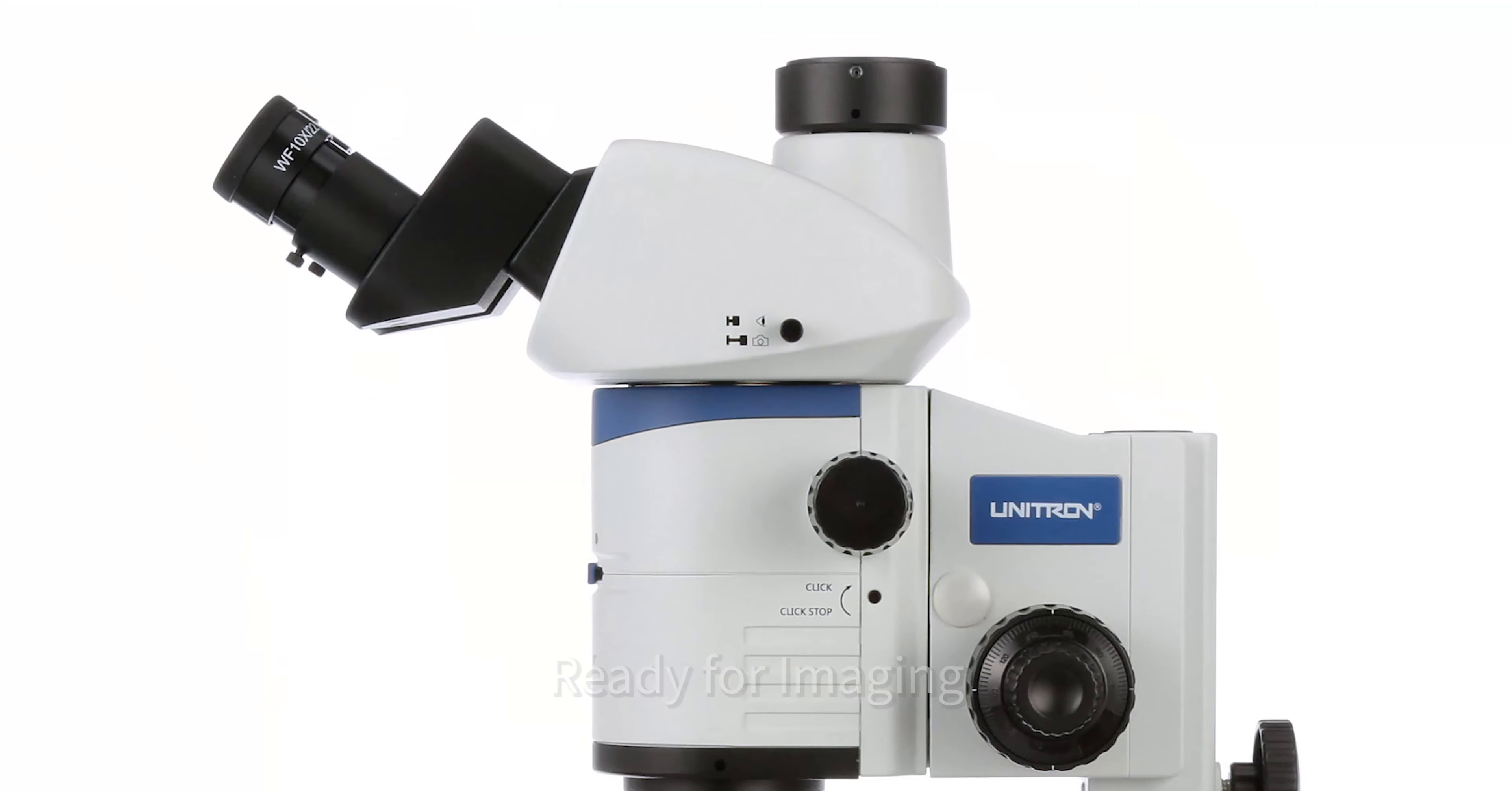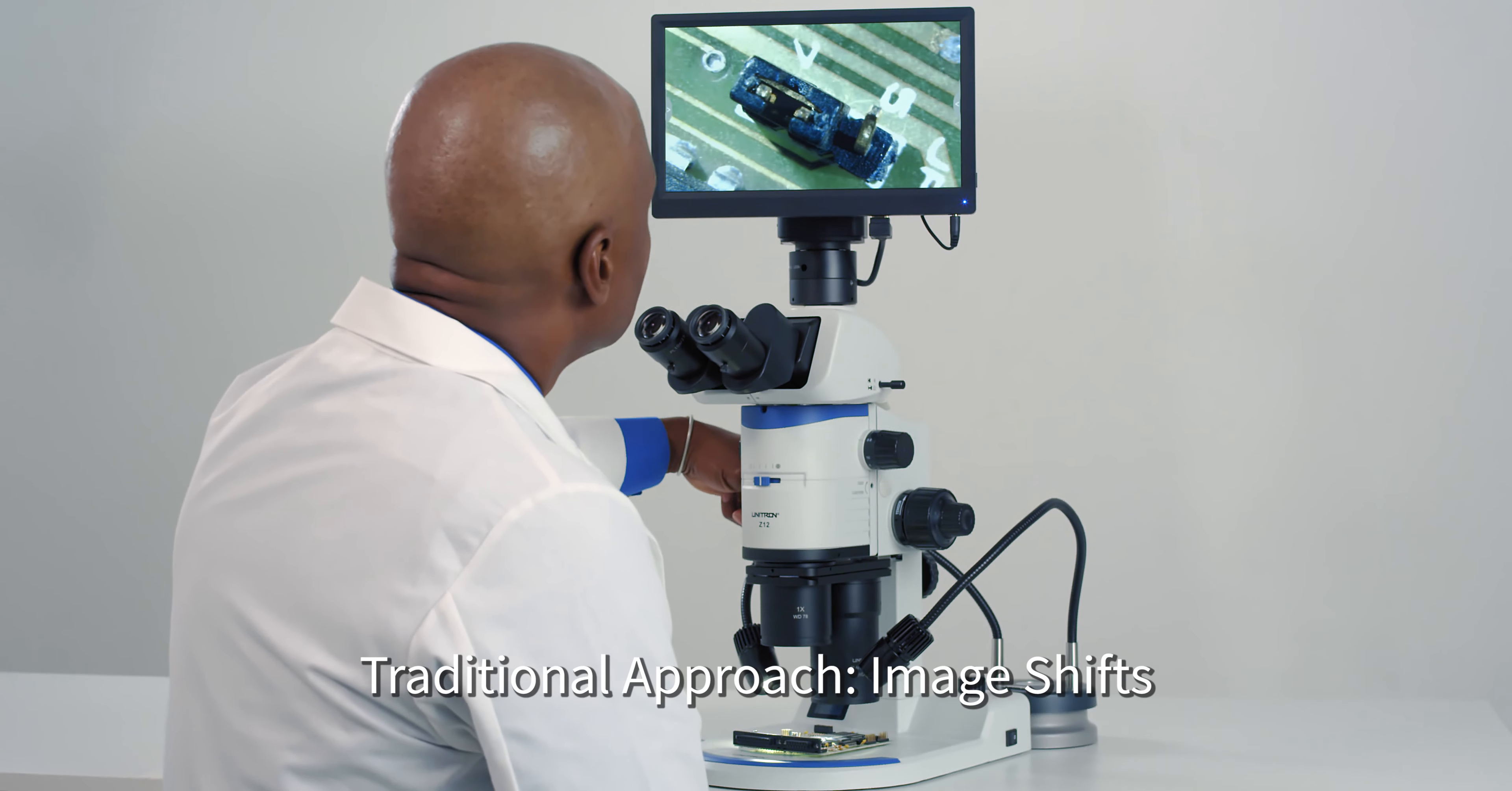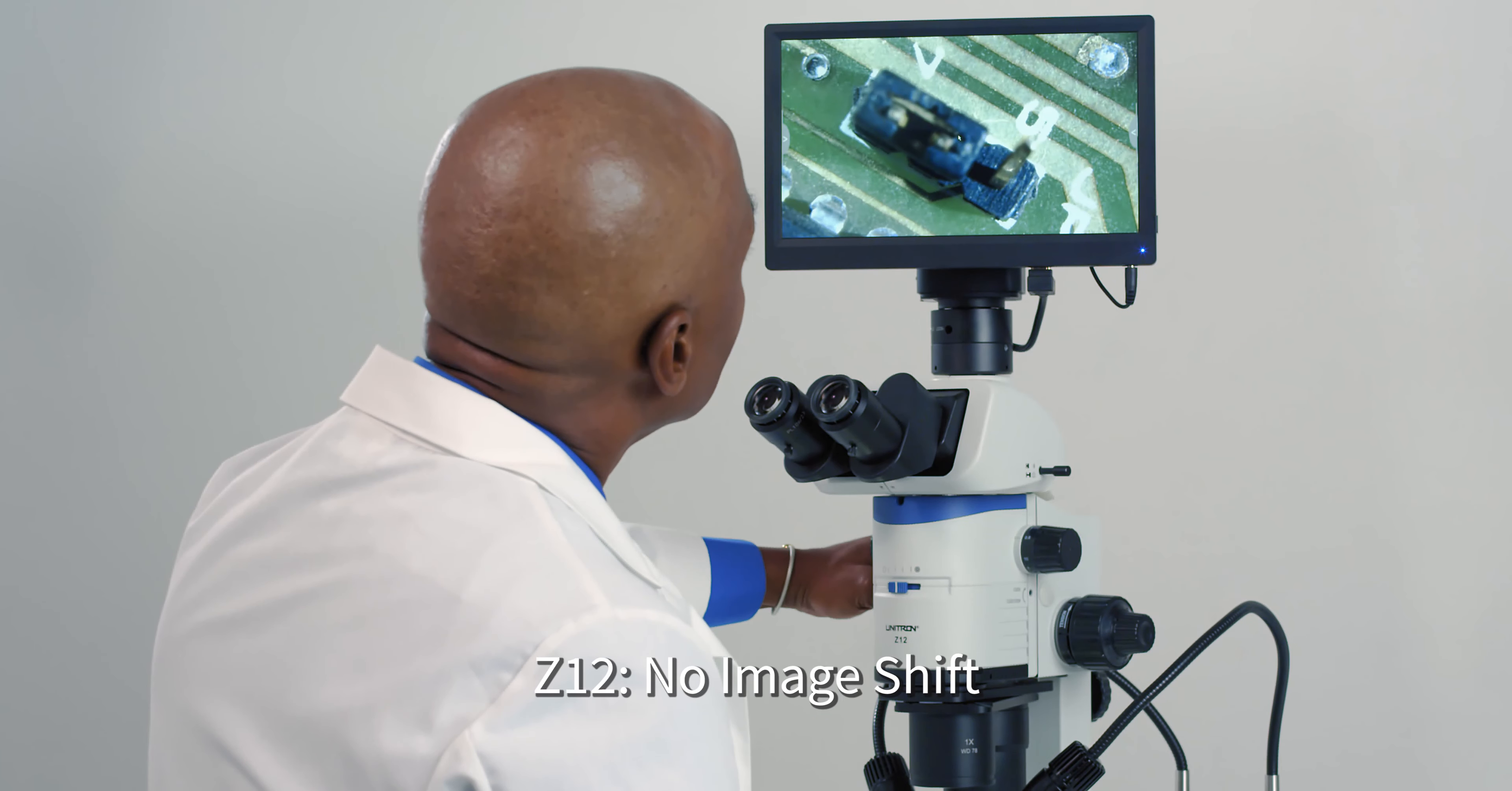The Z12 is ready for imaging. Just add a camera. The trinocular head allows you to image and use the eyepieces simultaneously. The optional two objective holder features an on-axis position, allowing you to focus in and out on a sample while the view remains vertically aligned.